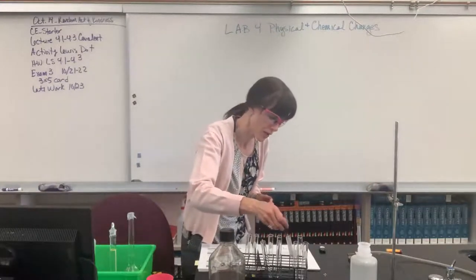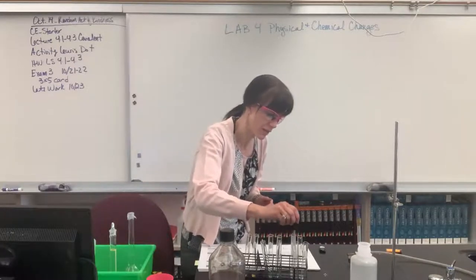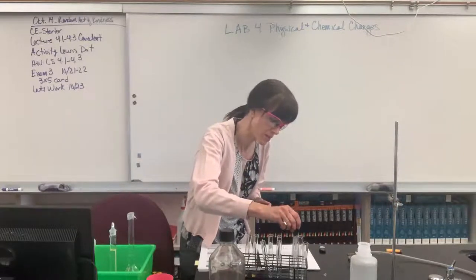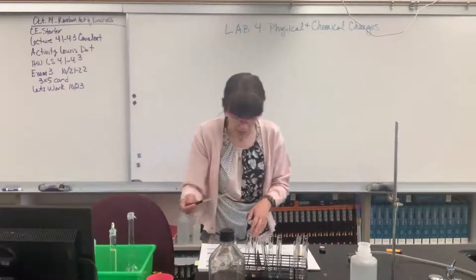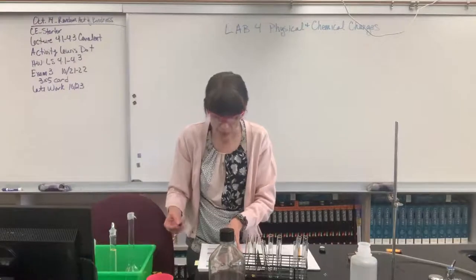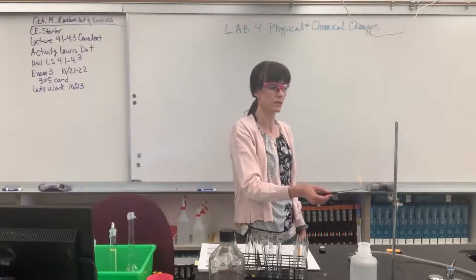I'm going to put my stirring rod in here, and I'm going to touch some of this white that's on here. Okay, so some of the white stuck to it. Not a lot, but some of it. Let's see if I can get more on there. Okay, and then it says put it in the flame. So let's see if we get that same yellow color. Let's look. There it is, beautiful yellow, woohoo!